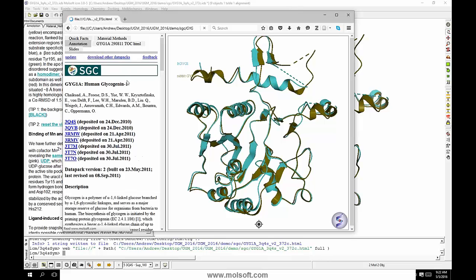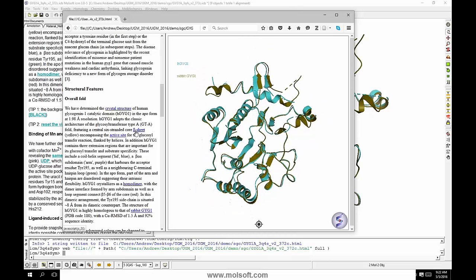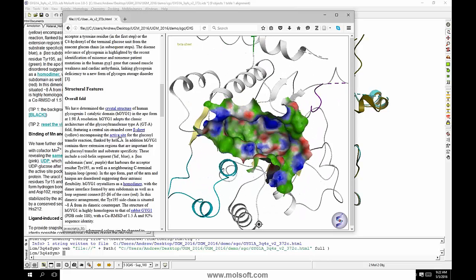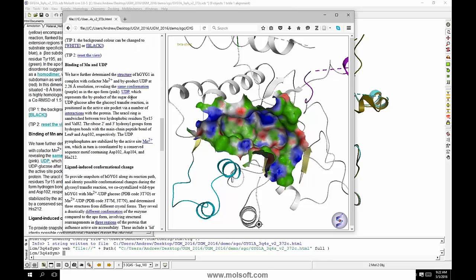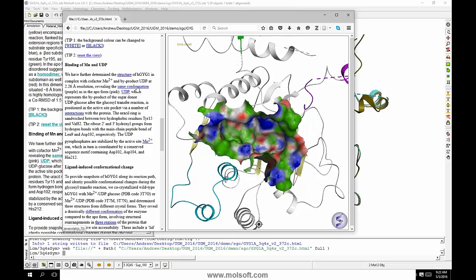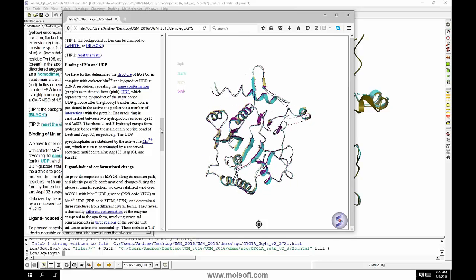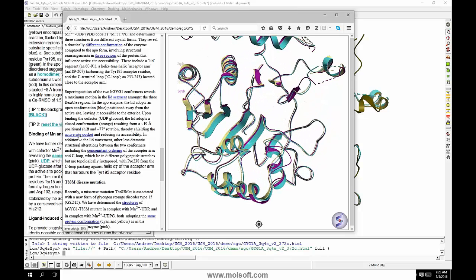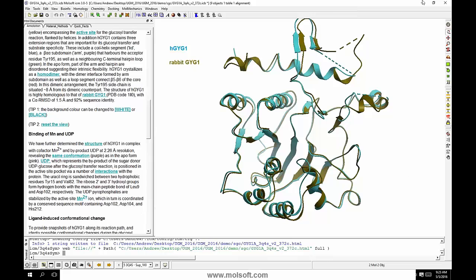So we can switch to these annotation slides and check some links. As you can see, all this slide transition and everything works as in the desktop application. So this is one example, and let me switch quickly to another one.